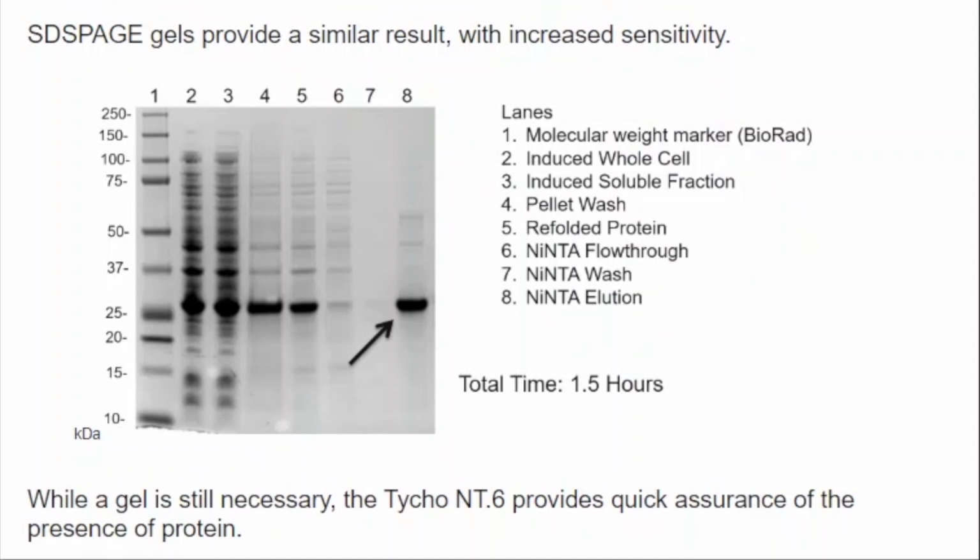This whole process of preparing the buffers, loading the samples, getting the gel ready, running the gel, staining the gel, destaining the gel, and capturing this image took me about 1.5 hours.